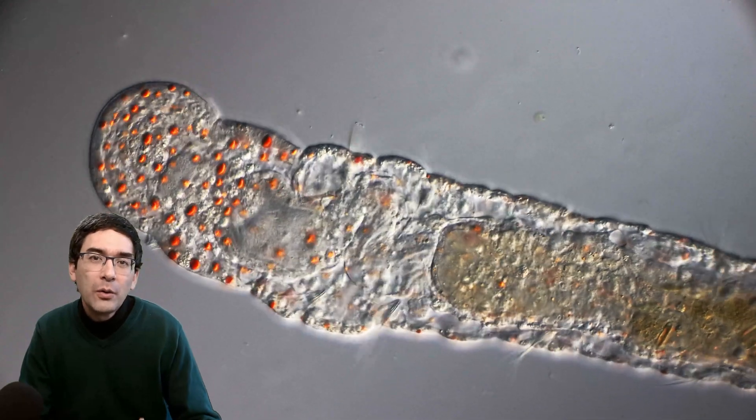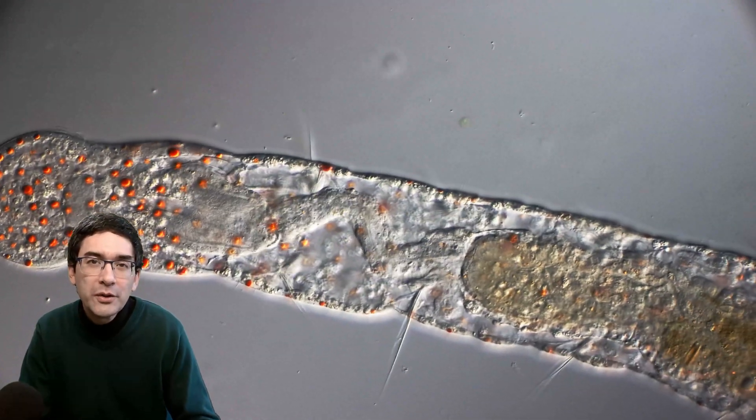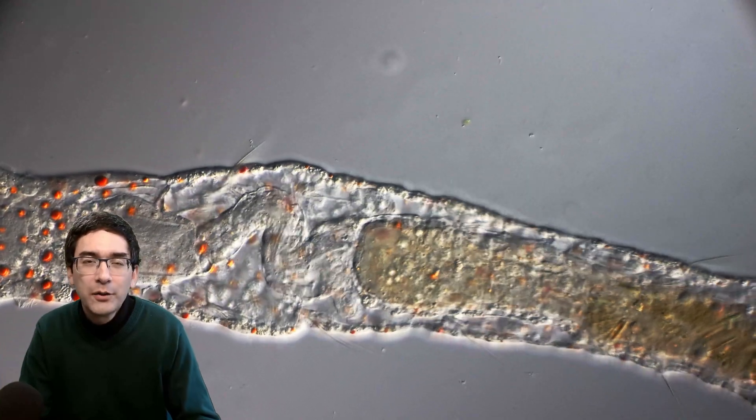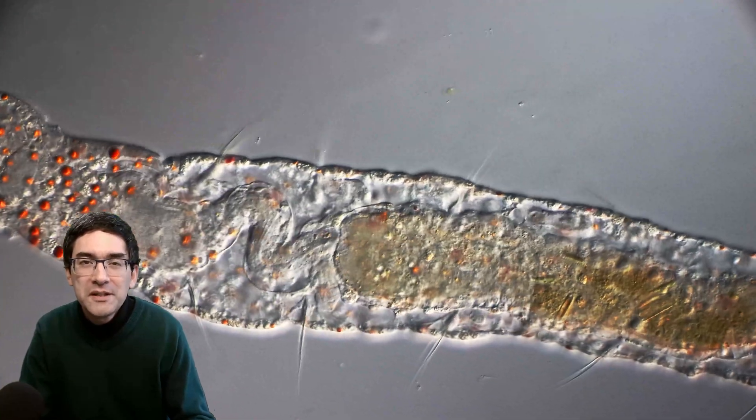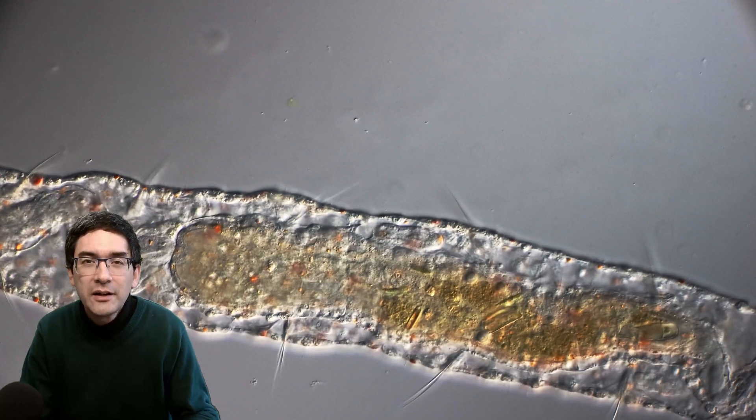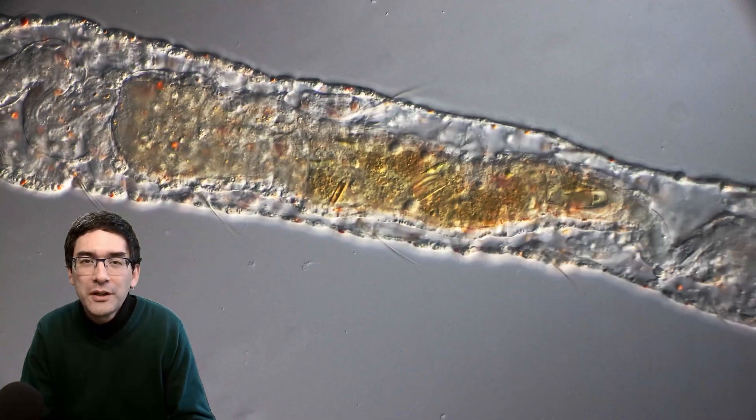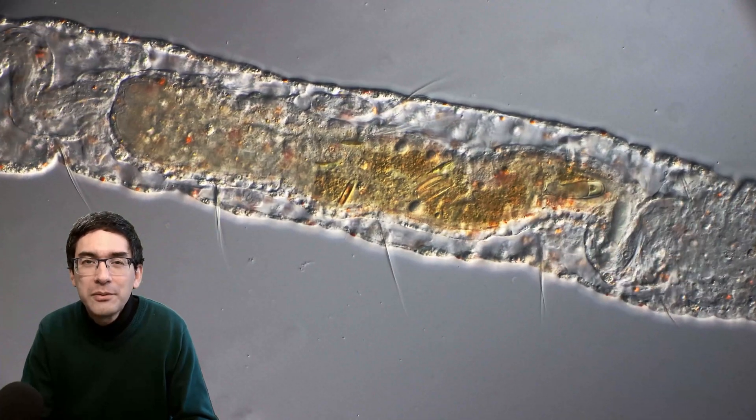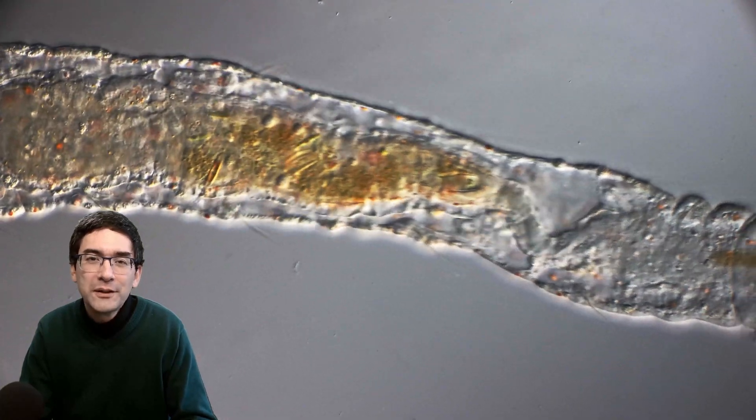Those oil droplets and where you can find them might also be used to identify the worm. Some species have them more on the head, others have them more scattered throughout the body, so those oil globules can be used to characterize different types of these worms.